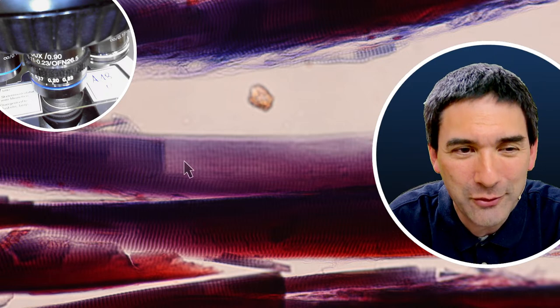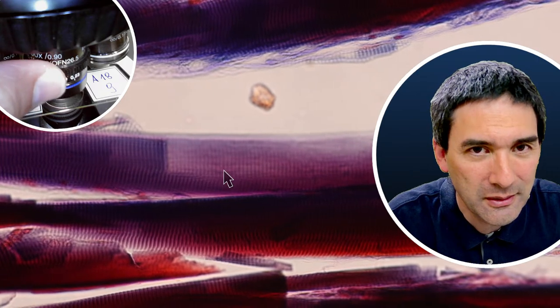dark bands. And being able to see that is a little bit like a quality check of your microscope. Are you able to resolve this? So I'm using a 60 times objective. Maybe I'm able to adjust this a little bit. Yeah. And these are the typical light and dark bands.